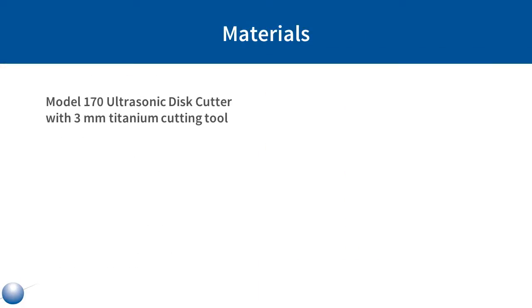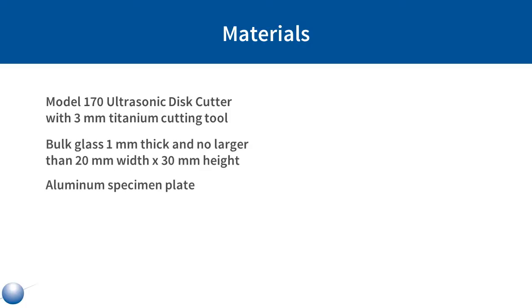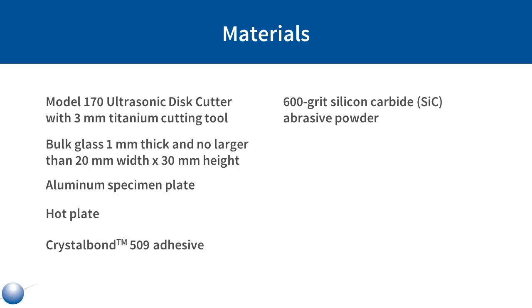You will need the Model 170 Ultrasonic Disk Cutter, 1 millimeter thick bulk glass, an aluminum specimen plate, a hot plate, crystal bond 509 adhesive, 600 grit silicon carbide abrasive powder, water, tweezers, a wooden stick, and cotton swabs.